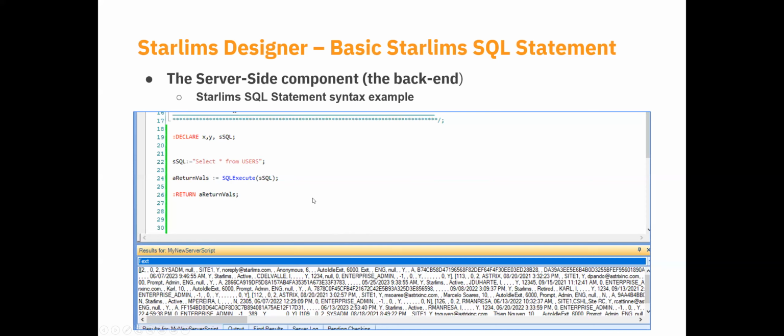So later on in JScript and in the server script manipulation of data, we can pull out just the elements that we're interested in seeing and pass those on to a control that's visible on a STARLIMS form.